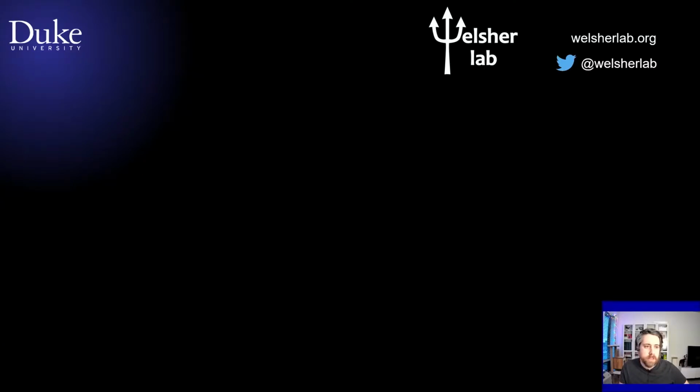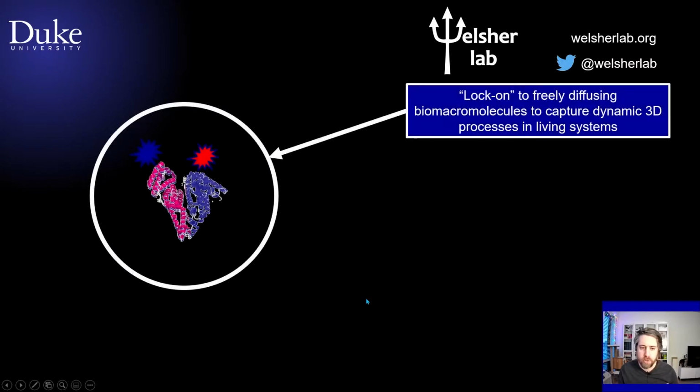So this video is to give you a little introduction about some of the things we've been working on here at the Welsher lab at Duke University in the Department of Chemistry. And one of the main things we're working on is looking at single molecules, in particular single biomolecules like enzymes, and how they function in living systems.